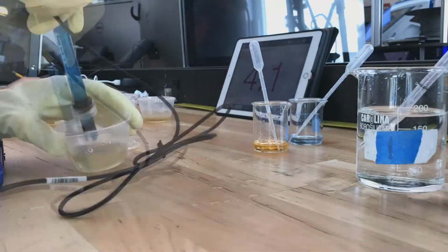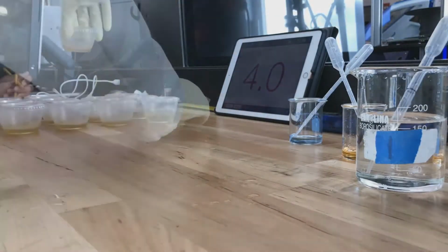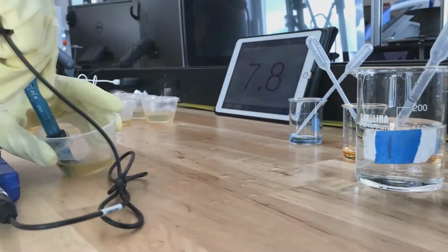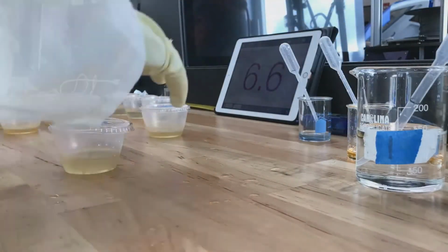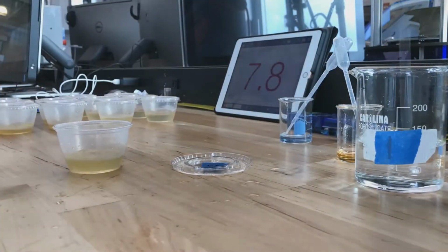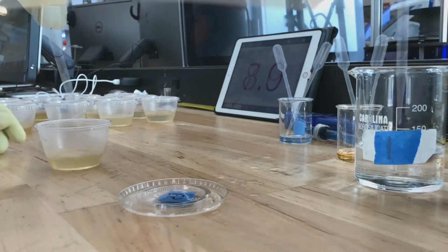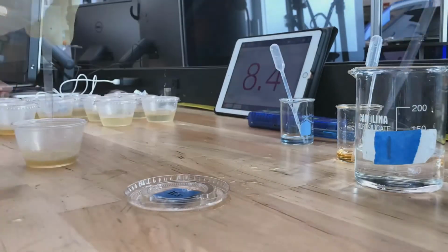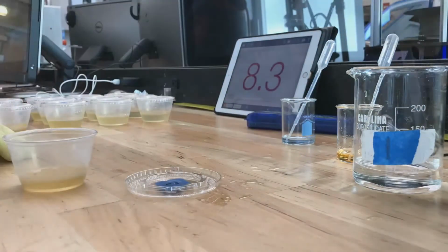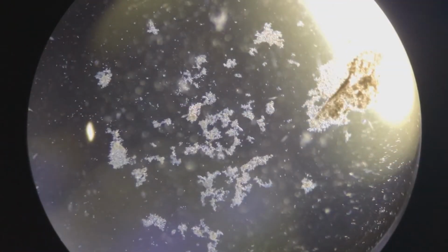Next came the long, slow, laborious process of carefully adding additional distilled water in either pH up or pH down, drop by drop, using a pipette until the pH of each plastic cup was at a different desired value, those being 4, 7, 10, and unchanged, and the total volume of the liquid in every plastic cup was equal at 29 milliliters. This ensures that the environments in each plastic cup are identical except for the one single factor being changed, the pH of the water. The colonies were allowed to culture for 1 day.